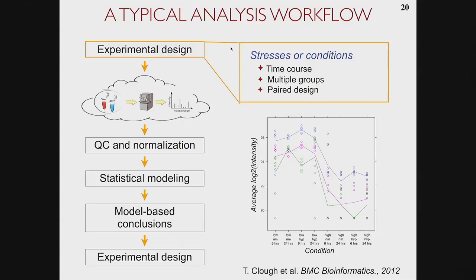So that means that if we have a small p-value from this method, it's not a biomarker, right? It's just the evidence that there is a difference on average. It doesn't mean that we can predict the status of the individual patient, right? We're still comparing the means of multiple subjects, but it can be useful, right?